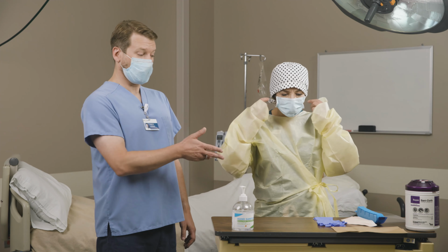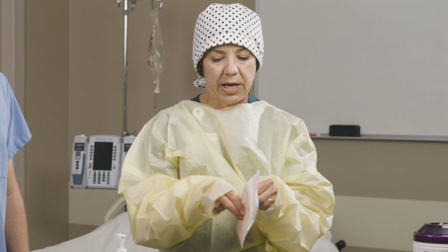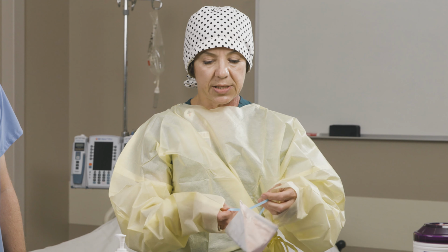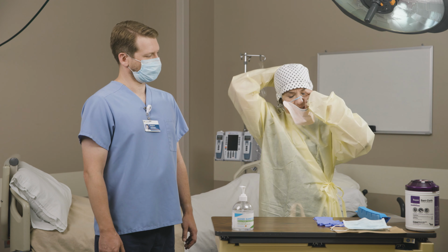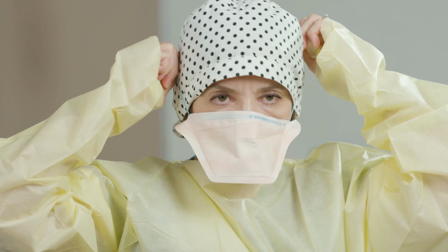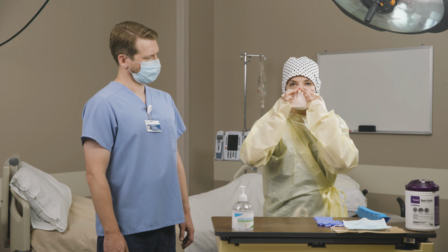Krista's then going to don her N95 respirator protection. When you don an N95 mask, if you're using this particular Halyard brand, you want to make sure and separate the bands, secure it under your chin, and extend the first band behind your head under your ears, and then put the other one on top of your ears, and then secure the fit on your nose.